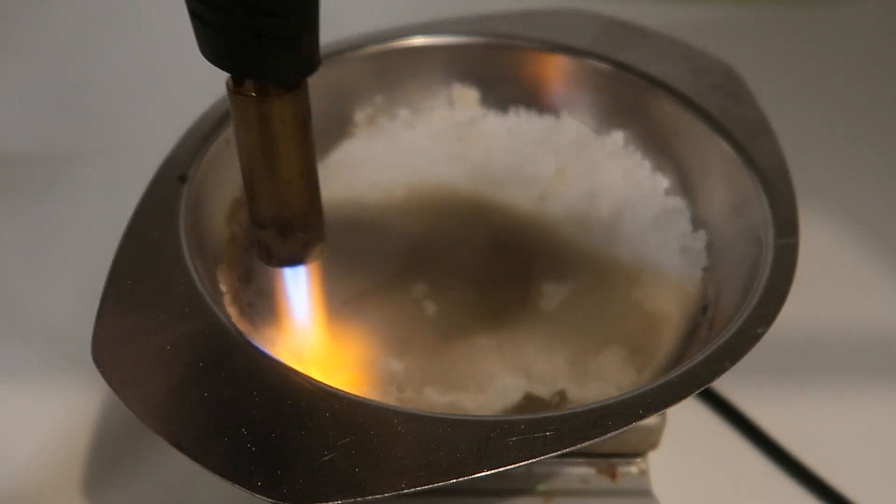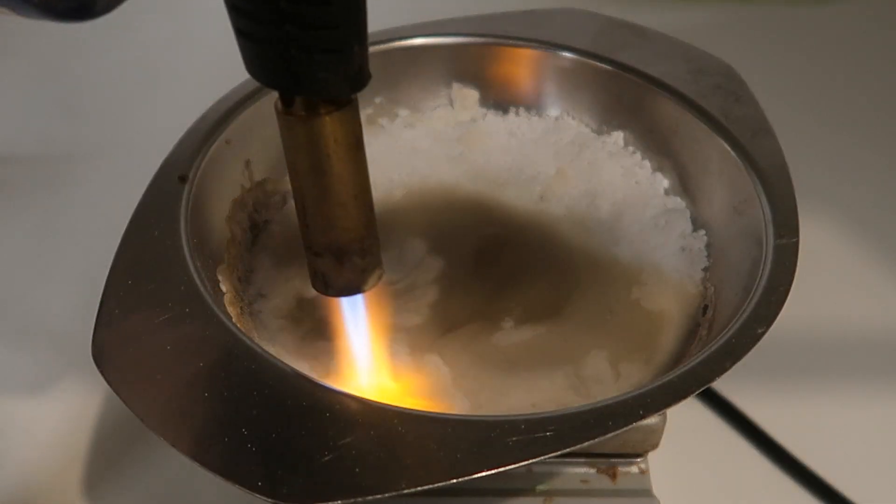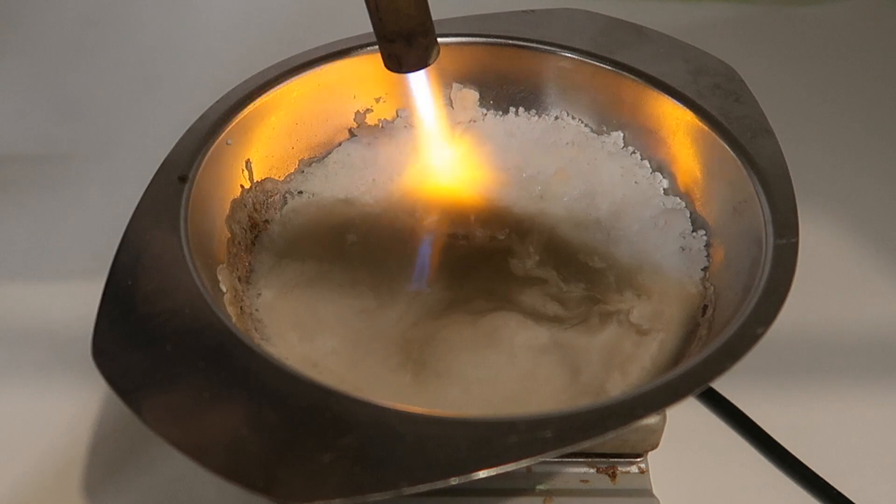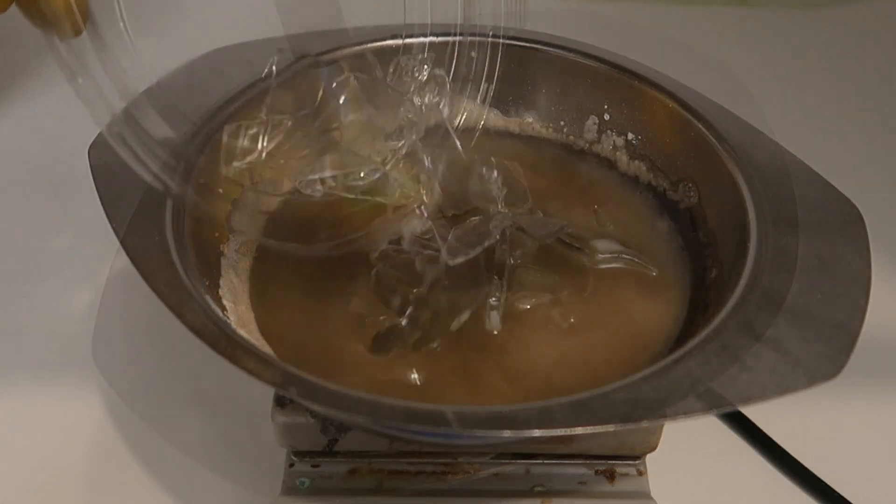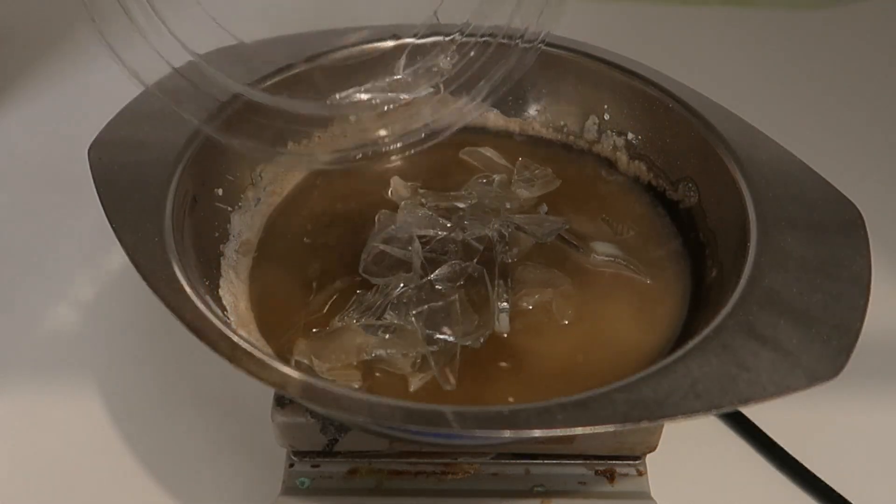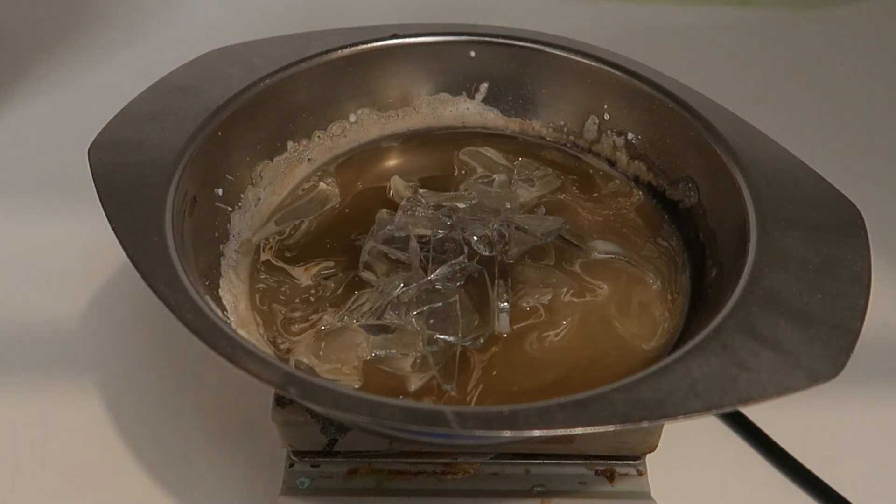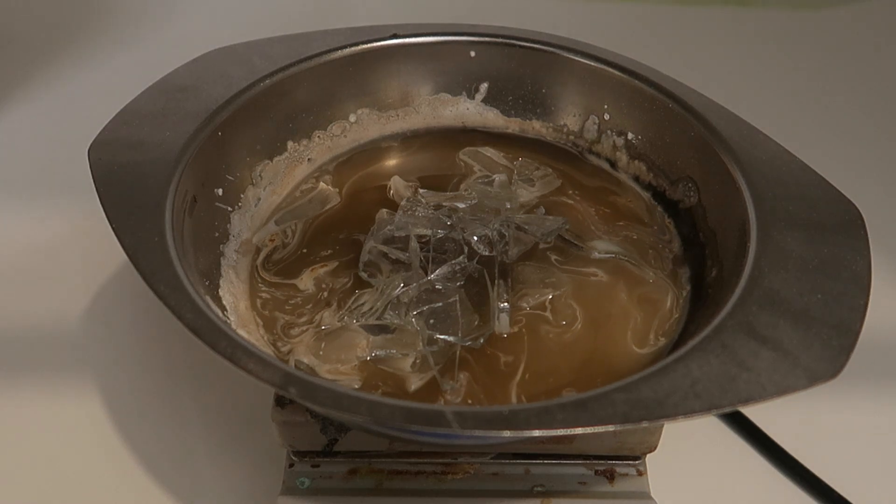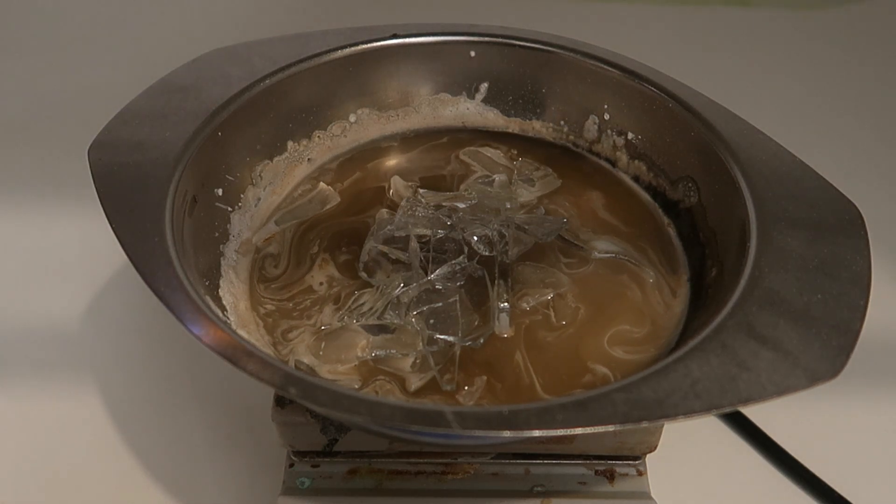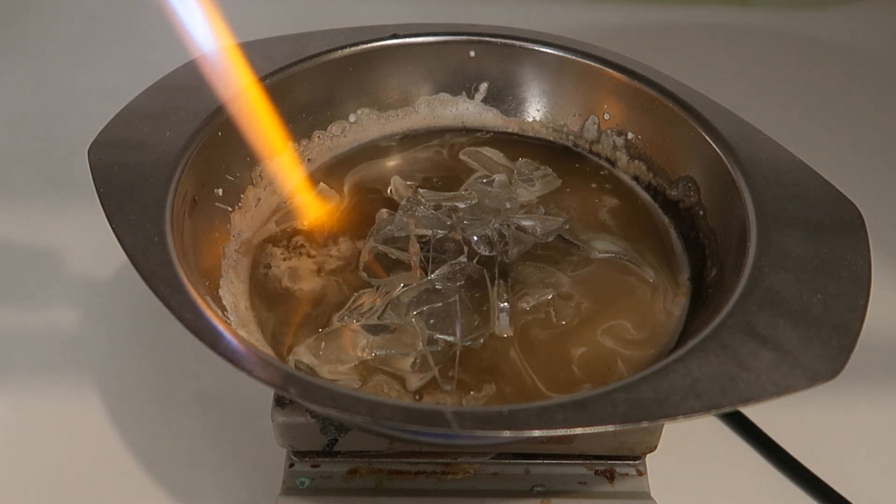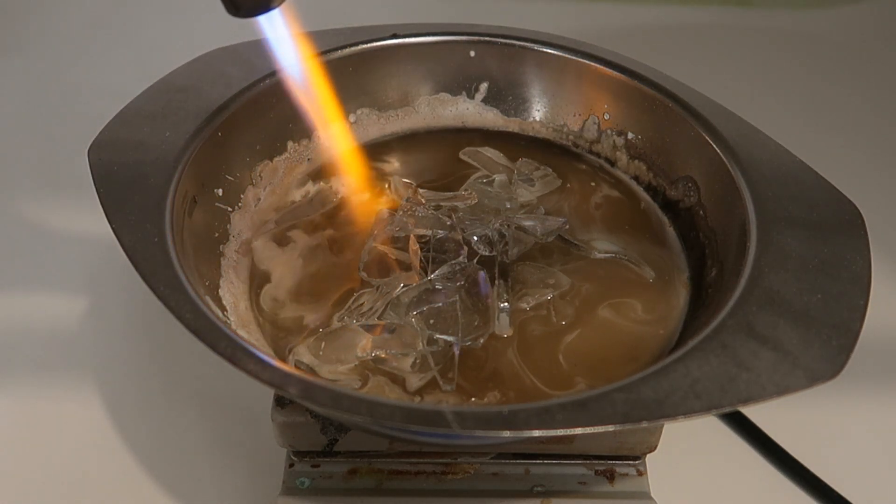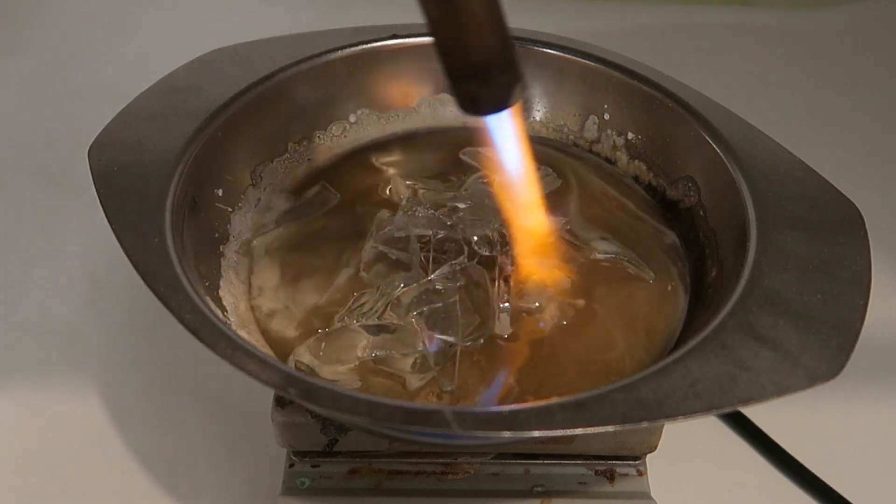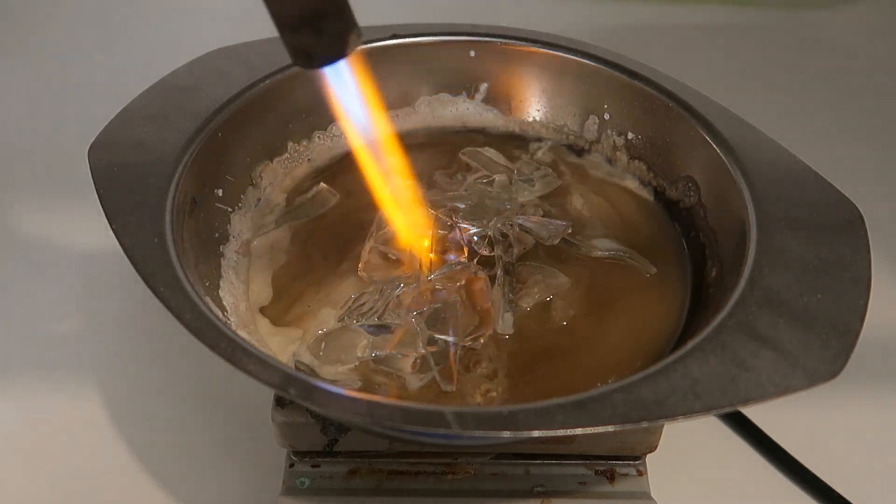Once everything was molten, I just added the pieces of glass and kept on heating. You may have noticed that the solution took a brown color. This is due to the spoon I used to stir the solution slowly melting away, and also from the pot itself to some extent.